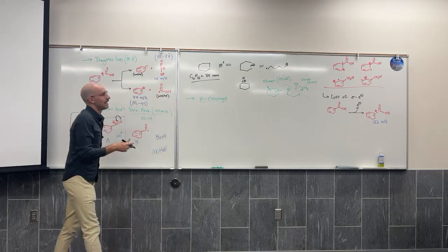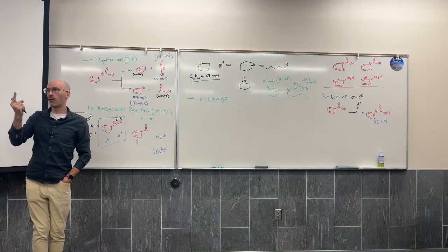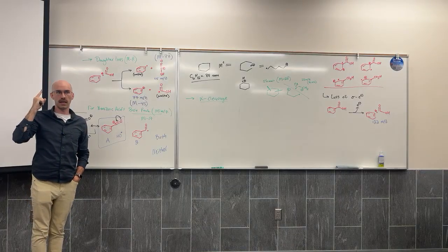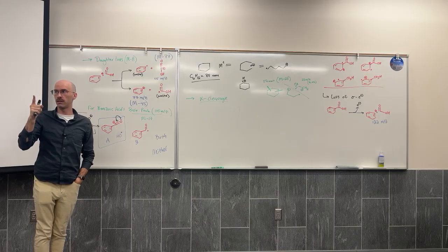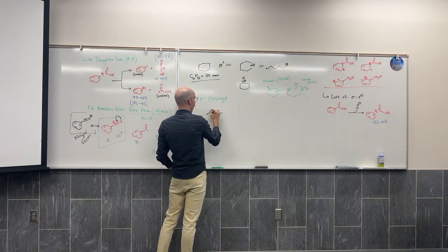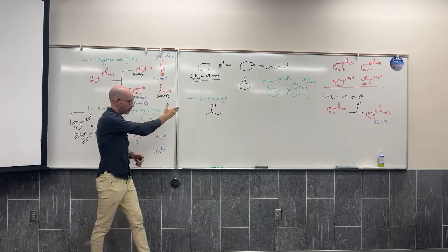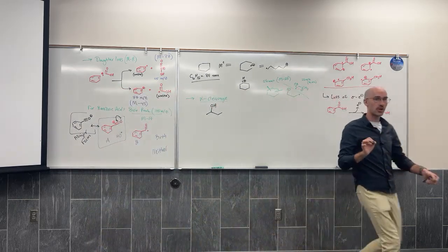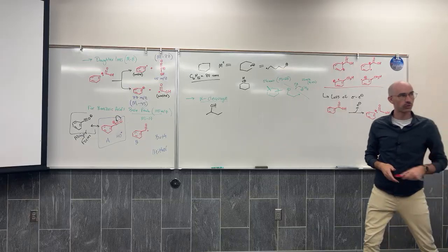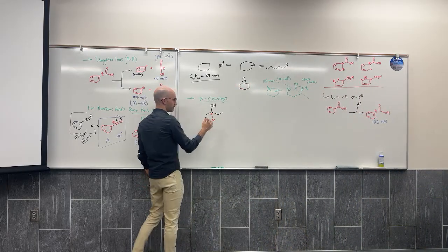Anyways, alpha cleavage, obviously we're talking about first priority, like option number 1, alpha. So what is alpha? Typically, alpha is a carbon of interest. So in a molecule like this, where I have a functional group, my functional group here is the alcohol. This is the alpha carbon.